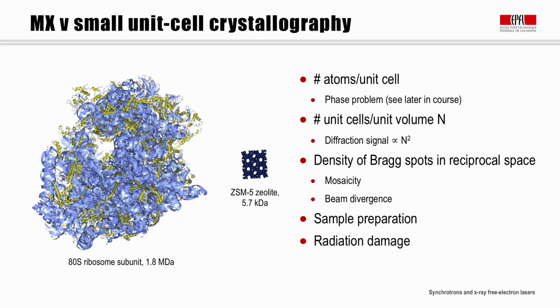Another immediately obvious qualitative difference between macromolecular crystallography and X-ray diffraction of crystals with smaller unit cell sizes is exactly that, the complexity of the basis within the unit cell. Now, when the basis contains several thousand atoms, conventional approaches to solving the structure through methods such as Rietveld analysis become entirely impractical, and other more sophisticated techniques must be brought to bear on solving the phase problem.